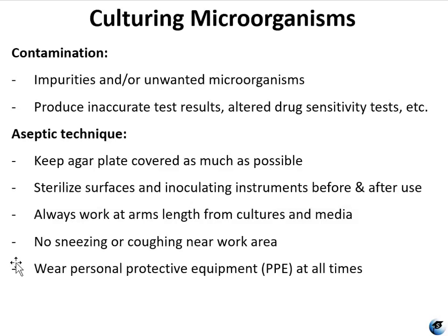You always want to make sure that you're not having things too close to your face, you're not breathing into your plates, don't sneeze or cough while doing your lab procedures, and if you can't help it, then you can sneeze into your arm or wear a face mask.